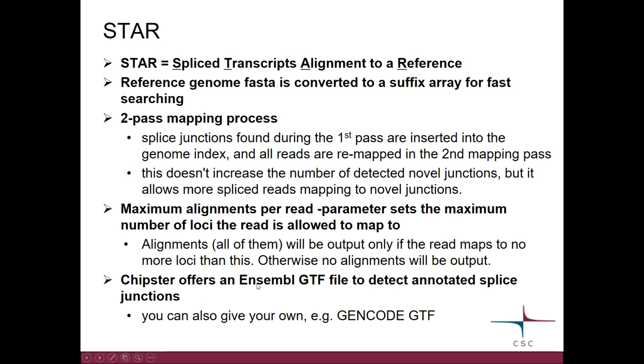Chipster has some Ensembl GTF files on the server, so you can give this information, which contains annotated splice sites, to STAR, but you can also give your own. So, for example, GENCODE GTFs are recommended.